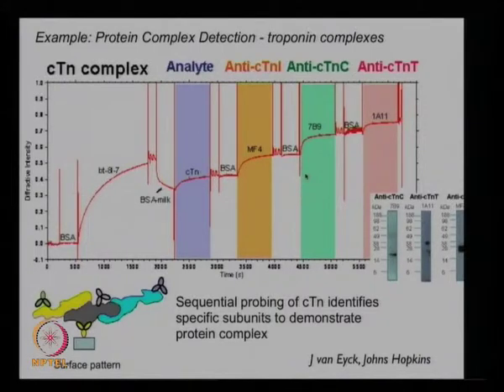So if you're doing a kinetic measurement, you need to know exactly where time zero is, when things were introduced. I think in this case, since they know the biology well, measuring different components will be easy, because they were able to generate anti-cTnI, anti-TnC and TnT fragments, and then specific antibodies for them. It's a pretty neat experiment where you can measure the complex protein, but also its individual components with the specificity. And then you're configuring your assay, because you can actually do displacements and take them away.